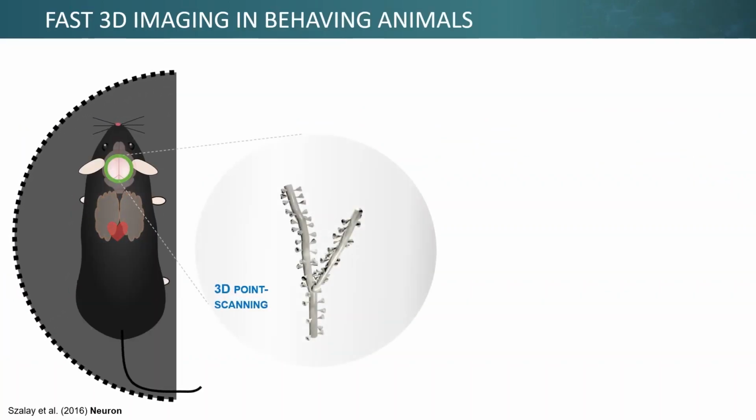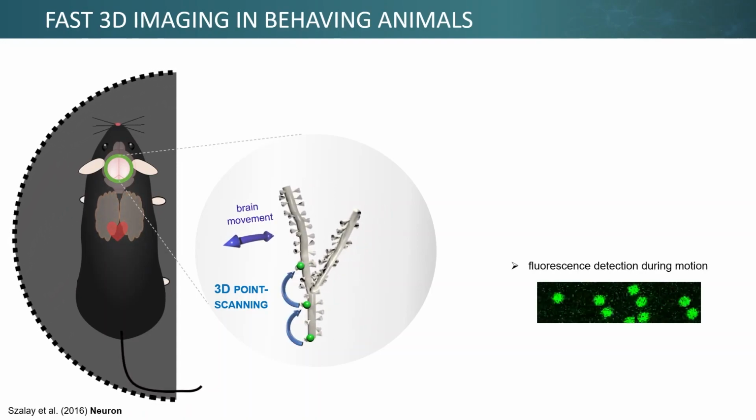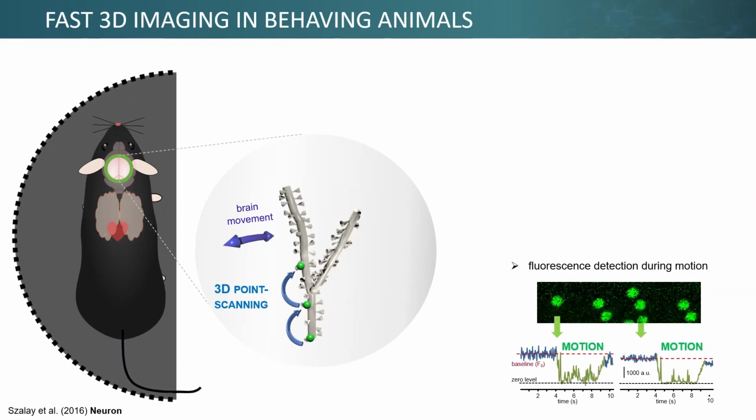But why is real-time motion correction essential in in vivo measurements? Well, the brain movement due to intended and visceral motion, such as heartbeat or respiratory movement, can cause very huge artifacts in the calcium signal, as shown on the right, especially when the ROI is relatively tight and the scanned object can move out from the scanned area or volume.